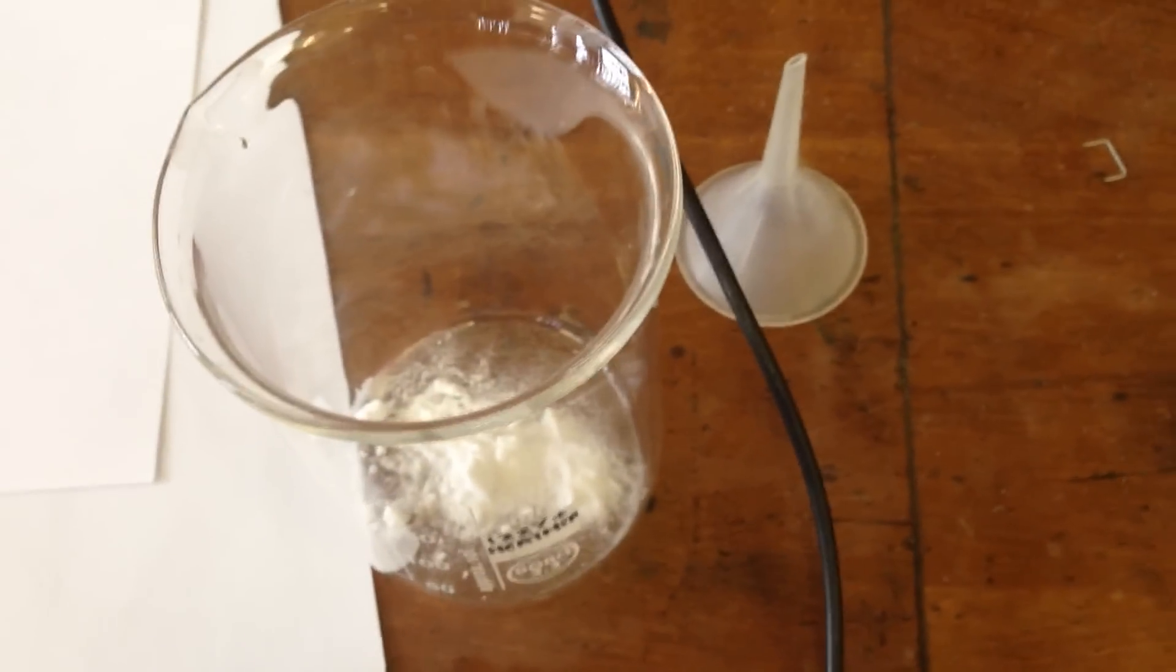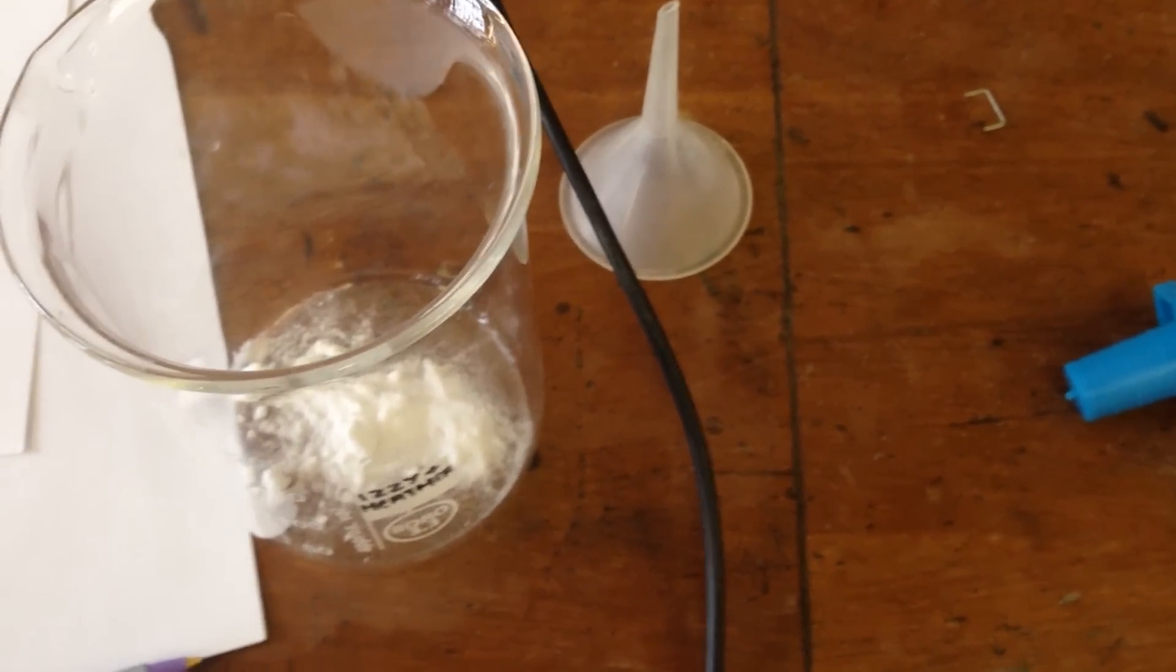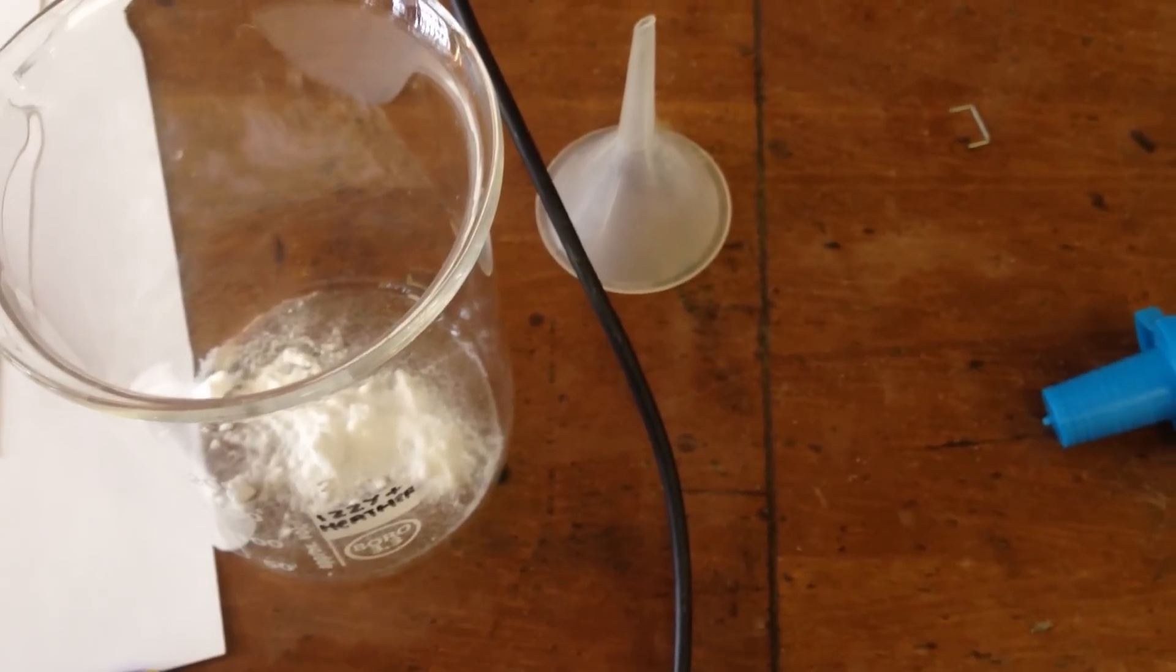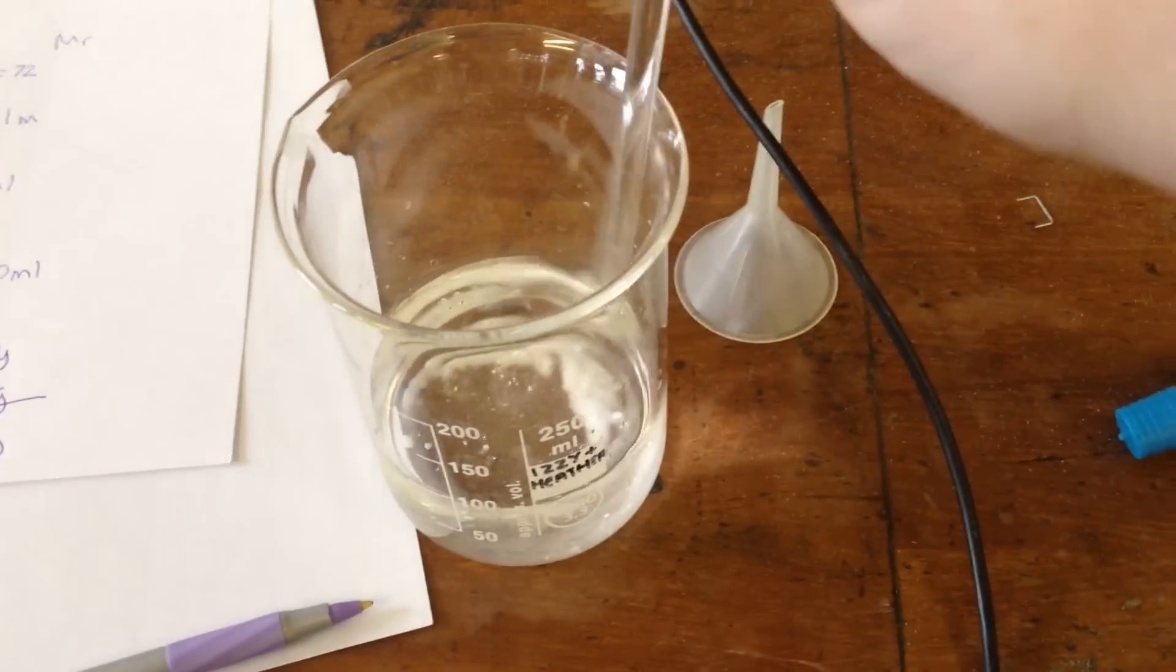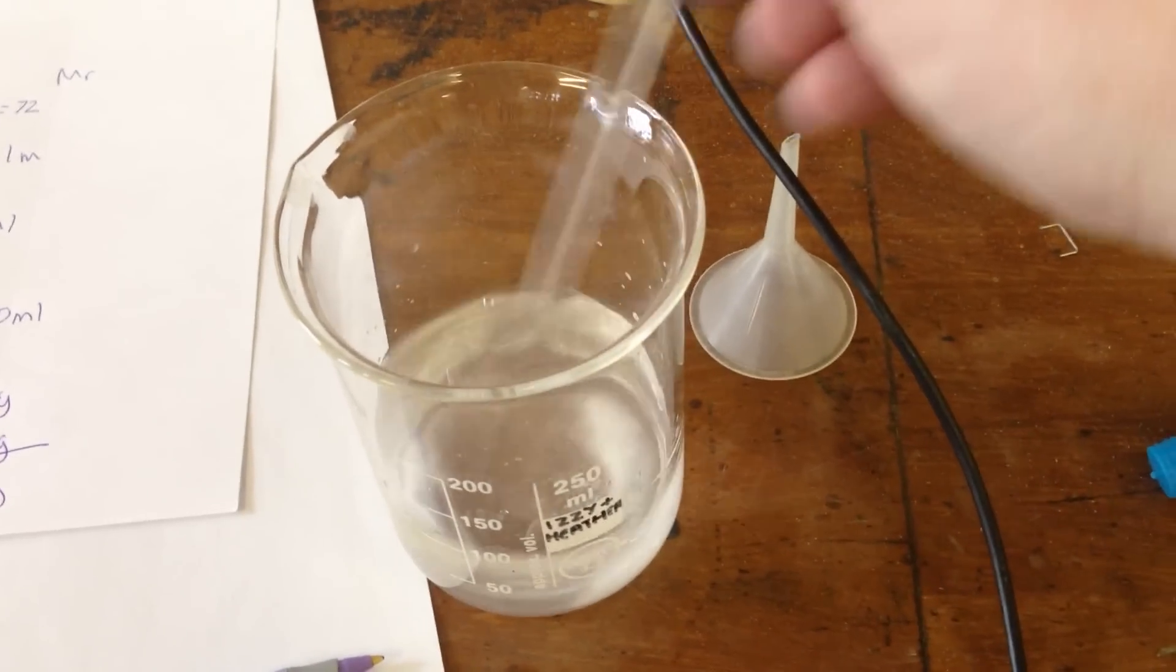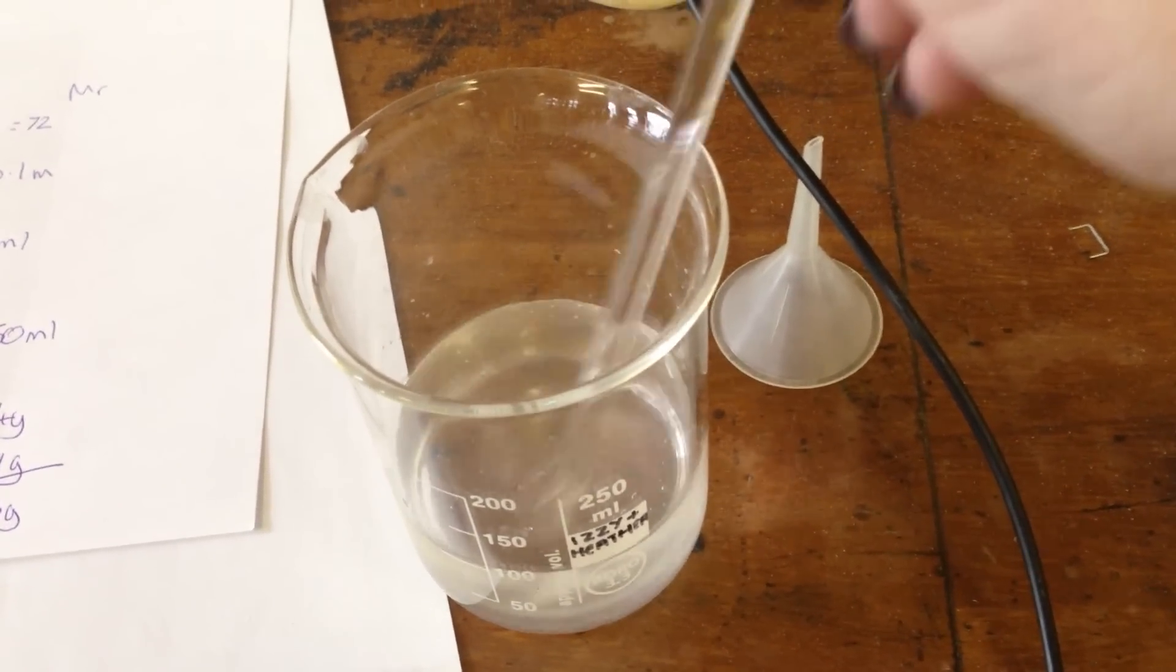So here's my sodium hydrogen carbonate in my beaker. What I need to do now is to dissolve this in about 100ml of water. So I've put that 100ml of water into my beaker with my sodium hydrogen carbonate that we've weighed out. I'm just going to stir this using a glass stirring rod until it is completely dissolved.